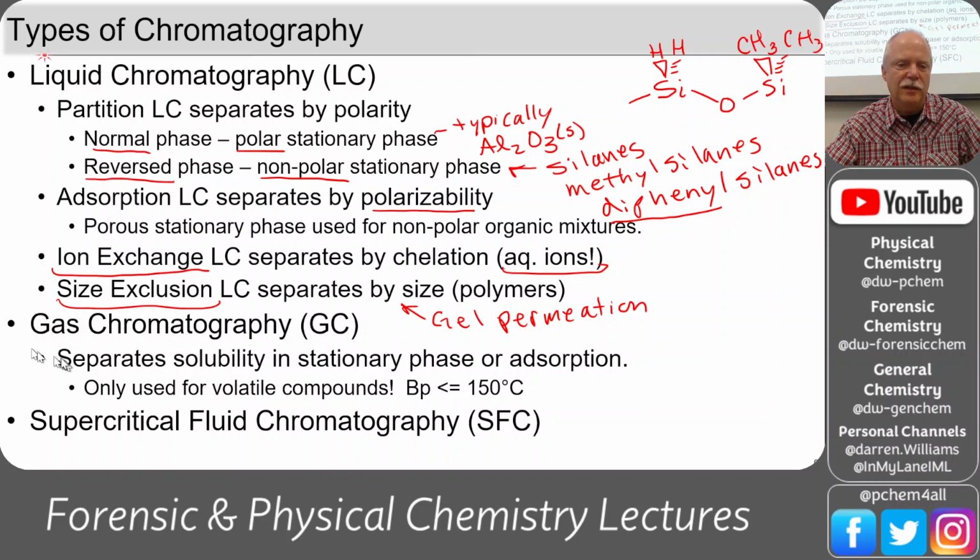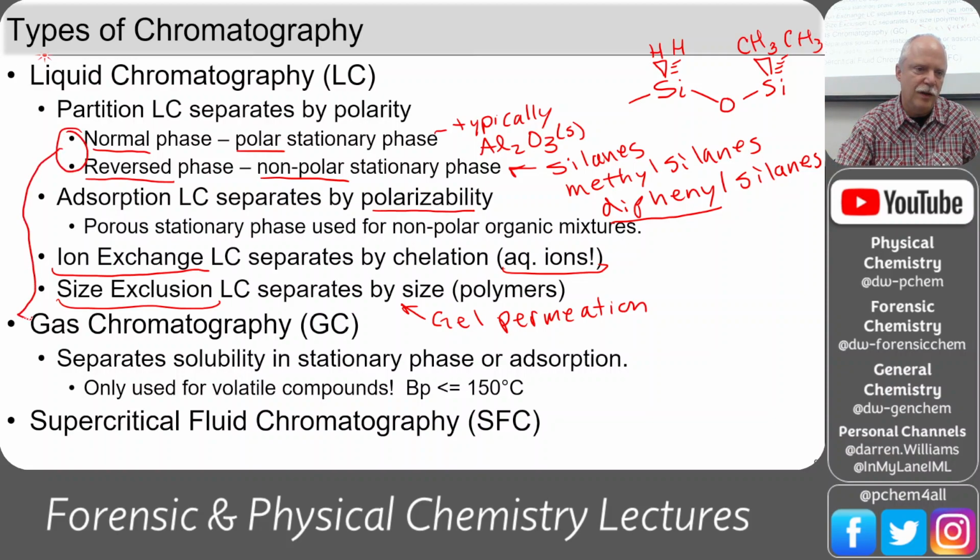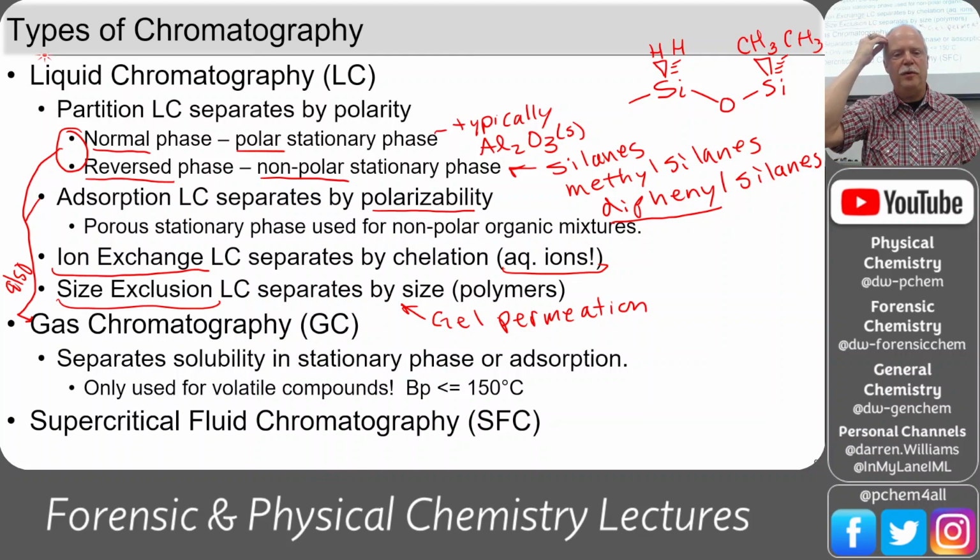And then you have gas chromatography, which separates by solubility in the stationary phase or adsorption. And again, you can have normal phase and reverse phase for these two. So normal and reverse phases also work for gas chromatography, and adsorption too. Okay. And then we have a technique that's a little bit higher cost, but it's very versatile, and it's supercritical fluid chromatography, where it typically uses carbon dioxide, where they pressurize it up to where it's a supercritical fluid, and it's the mobile phase, and it does really well.